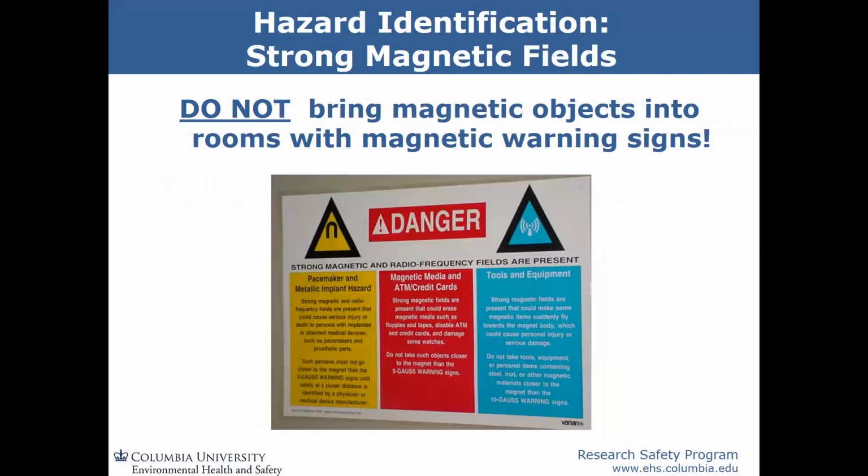Okay, so strong magnetic fields. Sorry, do not bring magnetic objects into rooms with magnetic warning signs. Strong magnetic fields can erase data from credit cards, move around magnetic objects like some tools, or disrupt the function of a medical implant. Always verify with laboratory personnel that it's safe to enter before doing so.